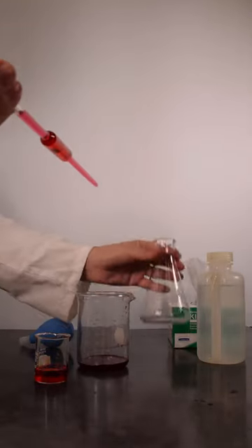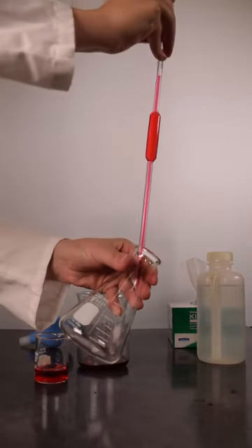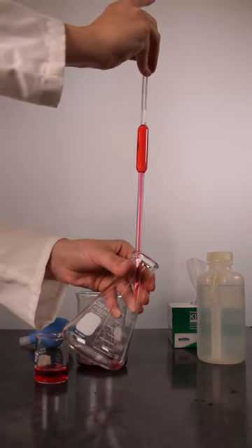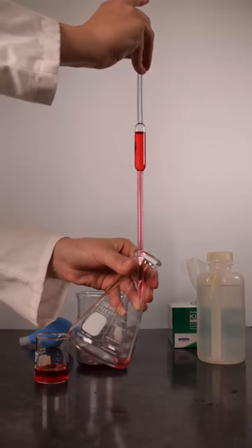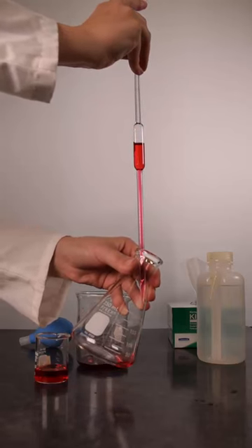Once the meniscus sits at the top of the calibrated line, place the pipette into an Erlenmeyer flask well below the top of the flask. Hold the pipette vertical with the pipette tip in contact with the inside of the flask.